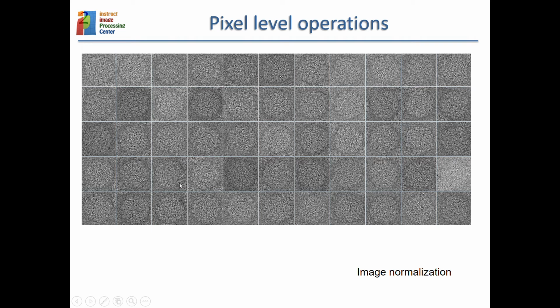Here, particles look like they have different gray values. This one looks darker than this one, which is a bit brighter. The reason might be that this image had the brightest pixel, so the maximum that is mapped to 255 makes the remainder of the histogram be mapped to slightly lower values.